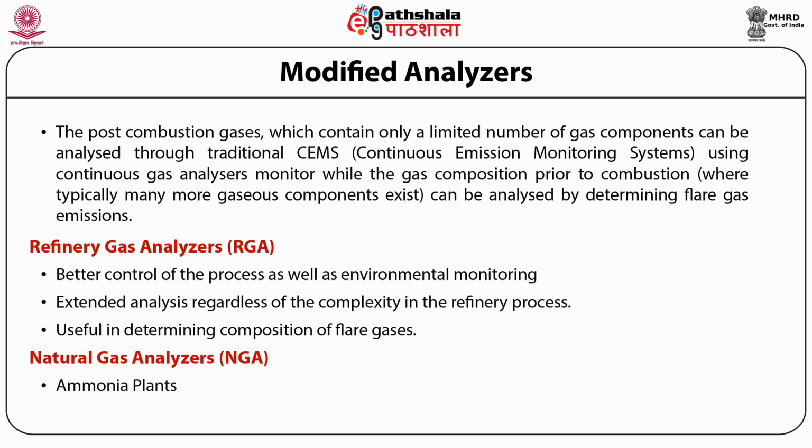In ammonia plants, commercial products such as nitrate fertilizers and smelling salts are produced. GC monitors for unconverted carbons and complete removal of carbon monoxide in an ammonia plant. For optimum synthesis conversion, it maintains hydrogen to nitrogen ratio in ammonia plants. A gas chromatograph will help a methanol plant to minimize losses of methanol, monitor for unconverted carbons, and minimize impurities in the methanol product stream.